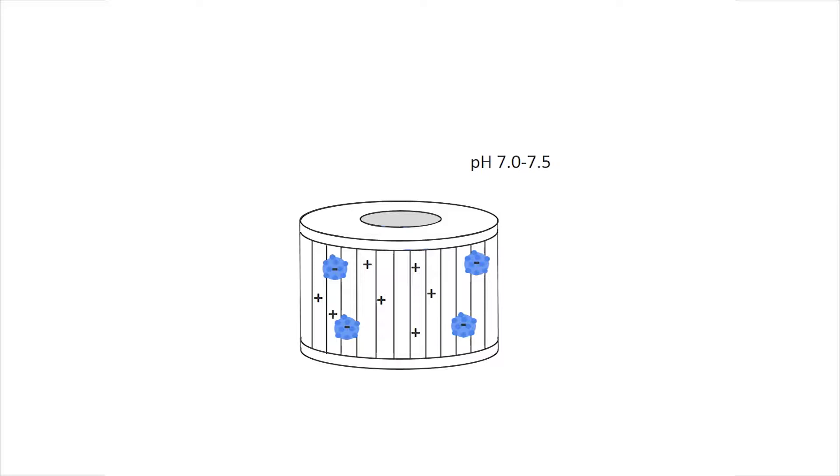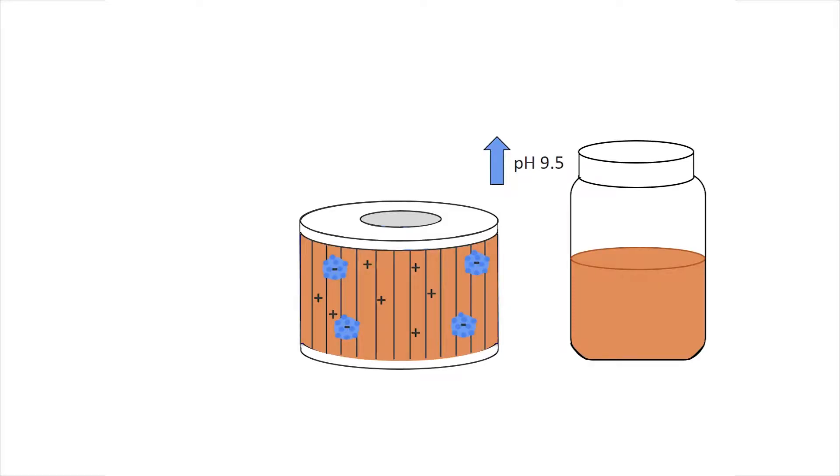To recover viruses and bacteria from the ViroCap filter and evaluate the sample, the filter is eluted using a high pH, high protein beef extract solution, and the microbial organisms are collected in the eluate.